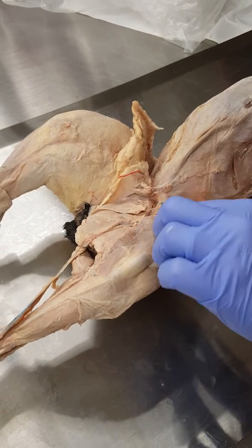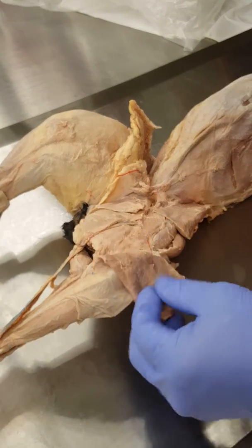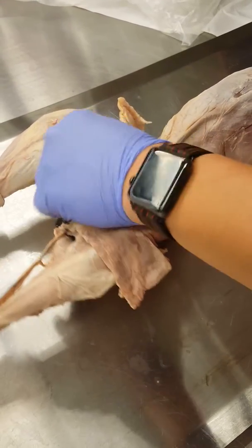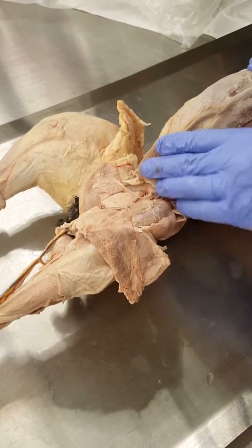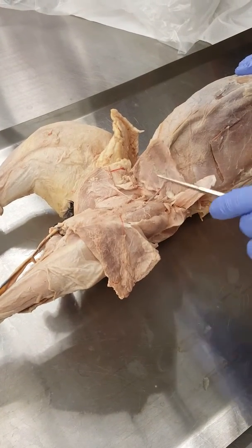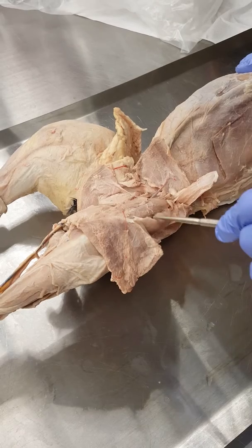If we reflect those muscles, so we reflect the sartorius so it's out of the way, and we reflect the gracilis so it's out of the way, then underneath the tensor fascia lata and the sartorius, deep to them, you're going to see the quadriceps.